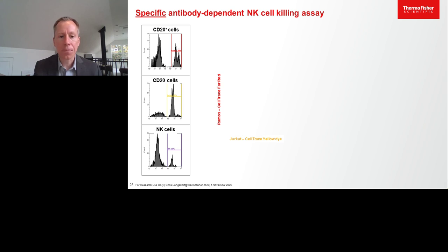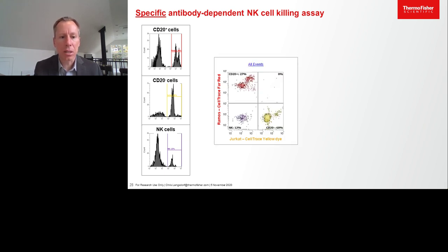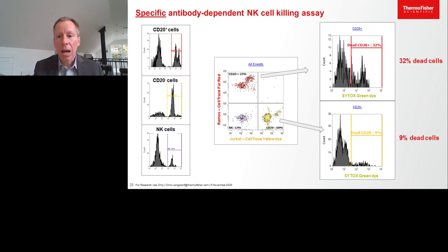before analyzing. And so much as we saw previously, it's easy to identify our 3 different cell types and then to determine the percent of our target and our bystander cells that were killed. And so functionally, this 4-color panel is showing us that we can easily identify our different cell types and that we can characterize the killing of one cell type by another. And so functionally, everything looks good here.